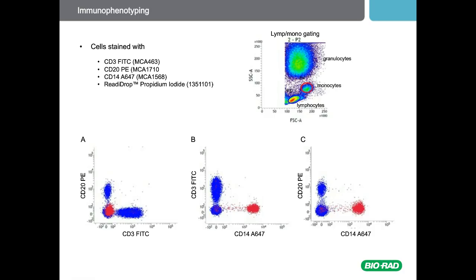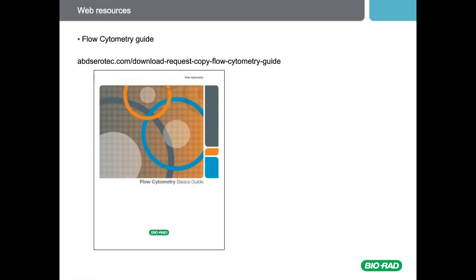I have not had the time to explain all aspects of flow cytometry today. However, this is a first in a series of planned webinars, and we will discuss other important topics such as fluorescence, controls, experimental design, and multicolour flow cytometry later in the year.